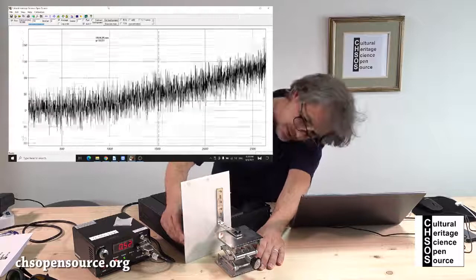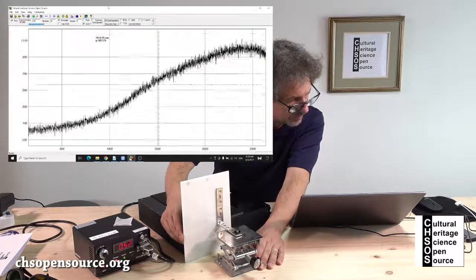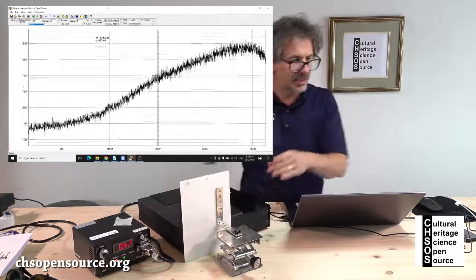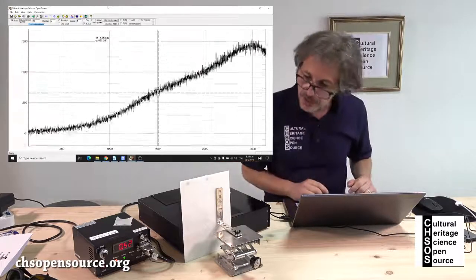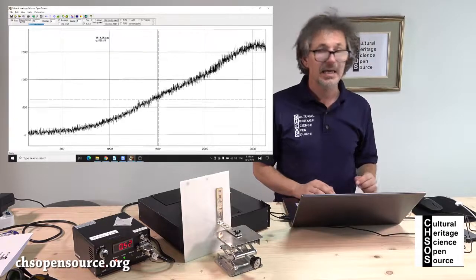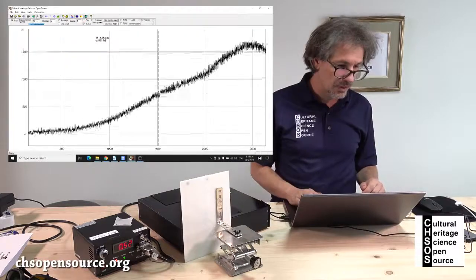So sometimes it's better. Okay, a little bit, 1030. So exactly, a little bit here seems to have the better signal, it's higher. Okay, so right now the collection, you see, is just 10 milliseconds. So definitely we need more. Let's put 100.